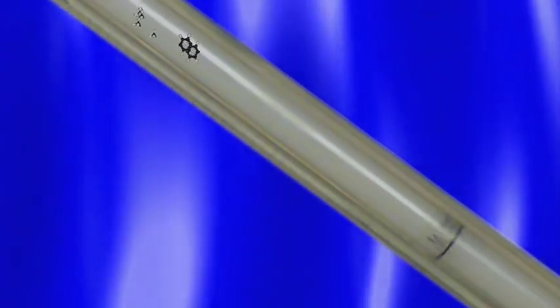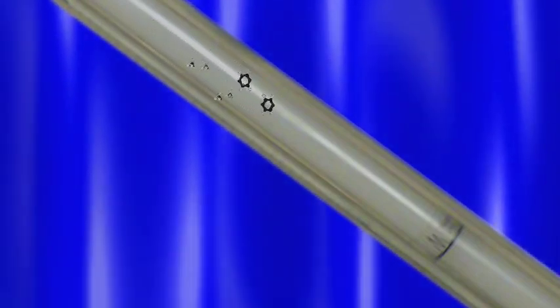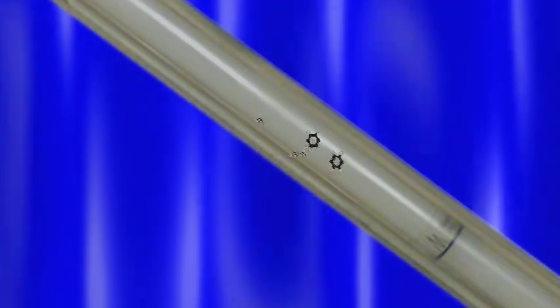Smaller molecules will enter the intricate pore structure of that polymer matrix, and therefore they will have a very long path length from the top of the column to the bottom of the column. In this way, size exclusion chromatography separates very large molecules, which will elute quickly, from very small molecules, which will elute very slowly.